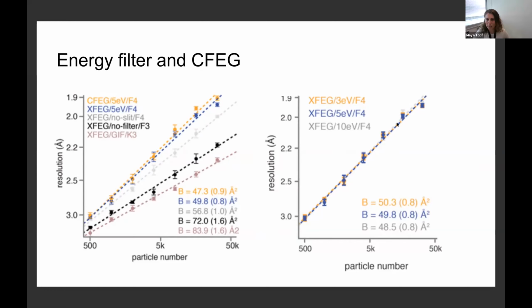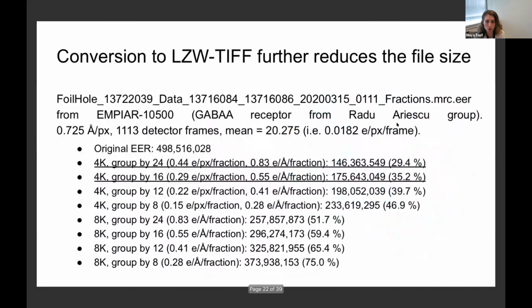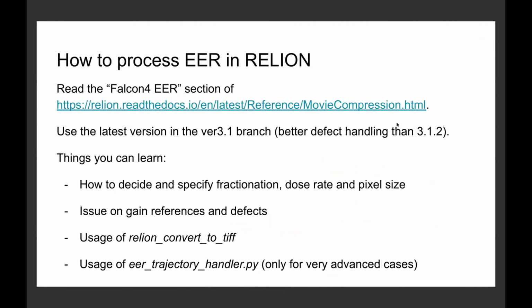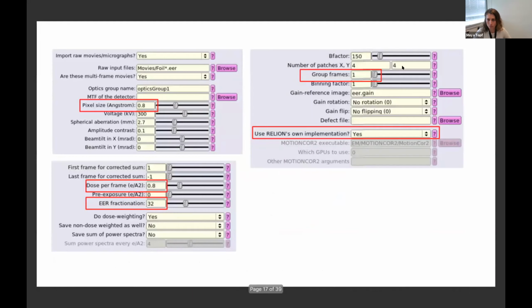Okay, we're making some progress here. So Joseph Bartley is asking, hi, in RELION polishing, are the EER files analyzed as post hoc defined dose fractions, or can the dose fractions be used to determine trajectories which are averaged to individual frames? Yeah, so this is explained in this page. By default, when you first do motion correction, you decide how many raw frames to fractionate into one virtual frame. And polish uses the same setting.